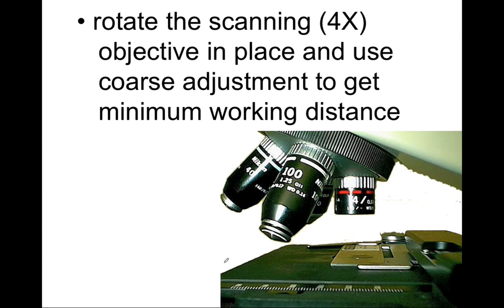Once we have placed the microscope slide on the stage and secured it, it is time to start focusing your microscope slide to the objective lens. You'll look through the ocular lens with your objective lens in place. You always want to start with the scanning objective lens — you never want to start with the high power or the low power objective. Start with the scanning at all times to give yourself the most working distance and make sure your picture is in focus.